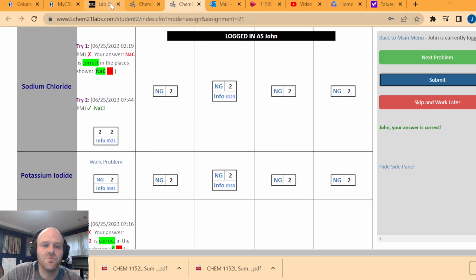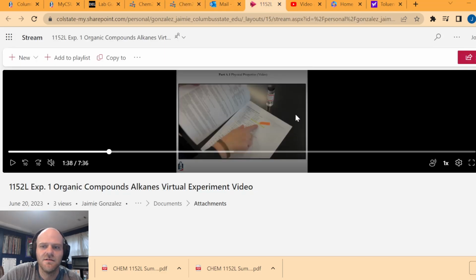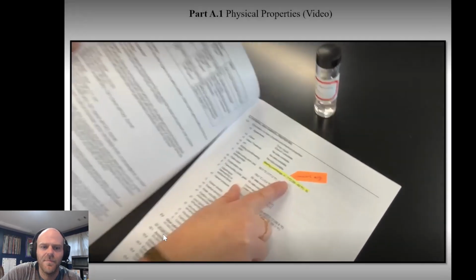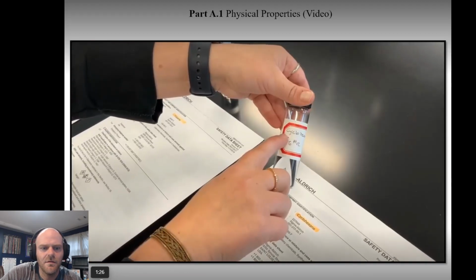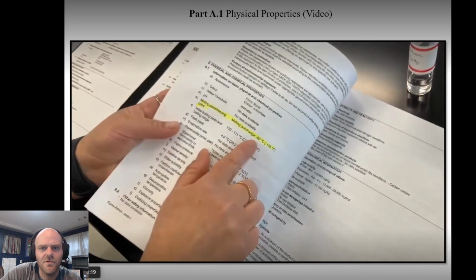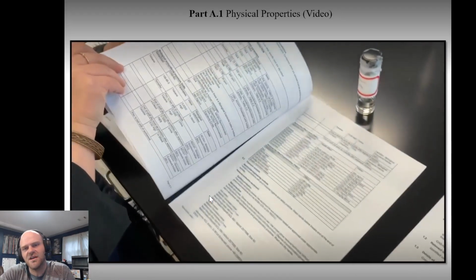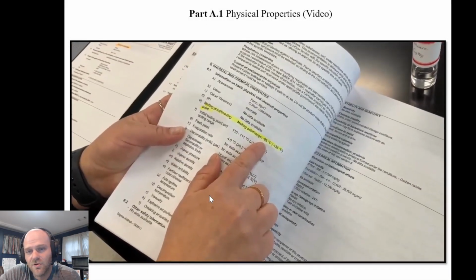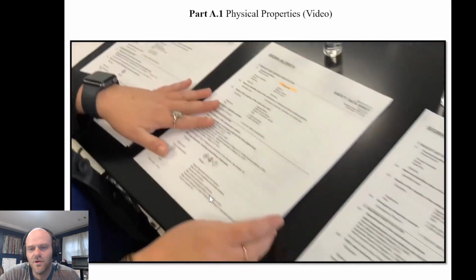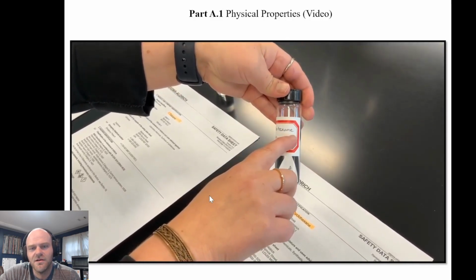All right, so next up, oh yeah, I gotta show you what the properties for cyclohexane were. Let me go back a little bit. Back it up some. A little more. I'll just start back at toluene. So that's toluene, C7H8, formula. Melting point negative 93 degrees Celsius. So a very low melting point. You'll notice a trend in this, whether or not it has a high or low melting point.